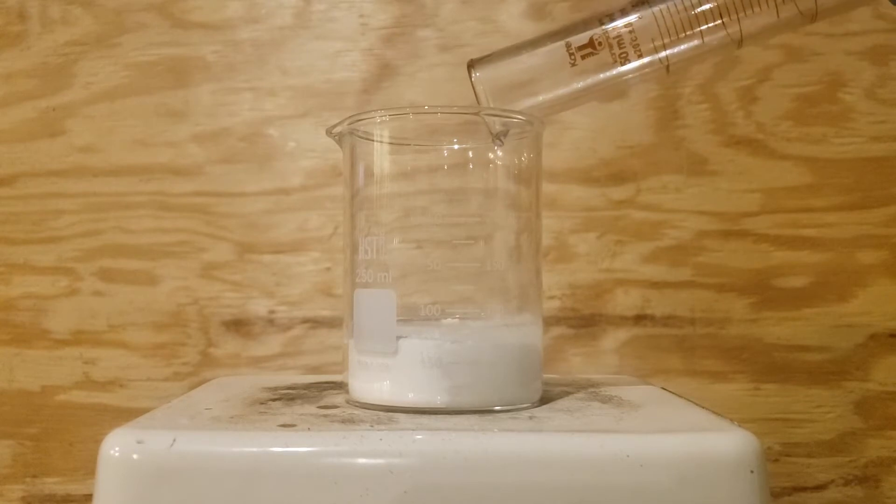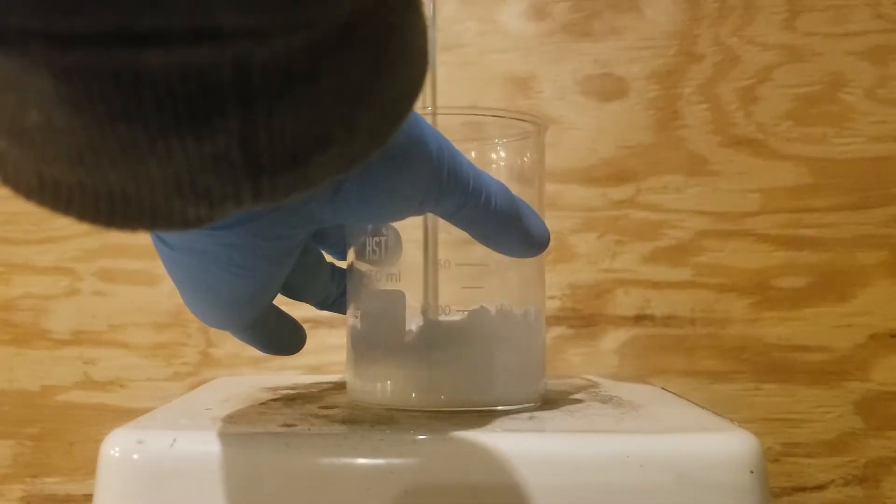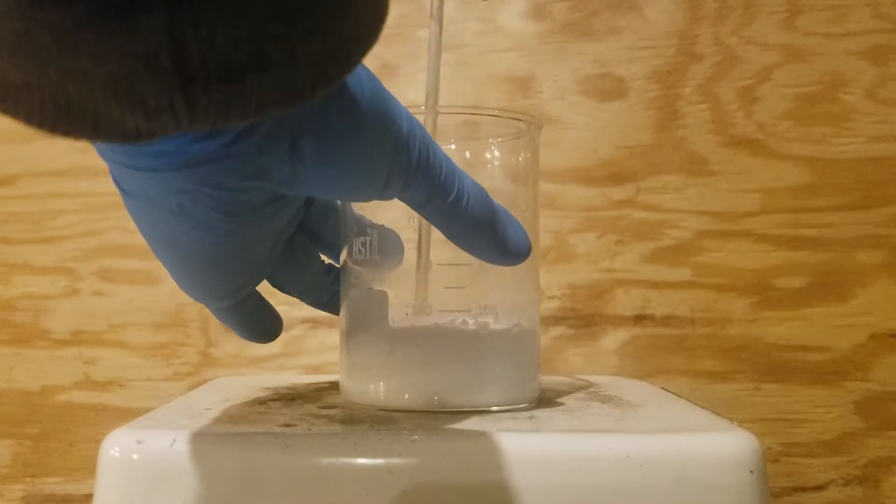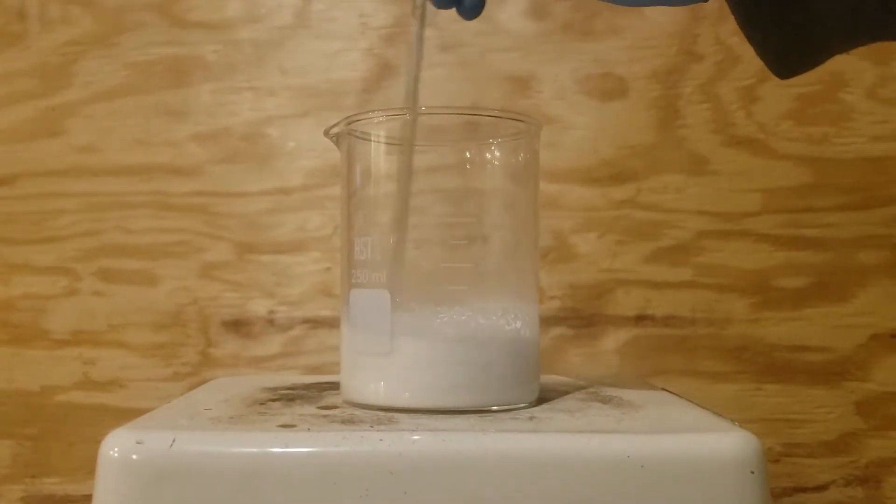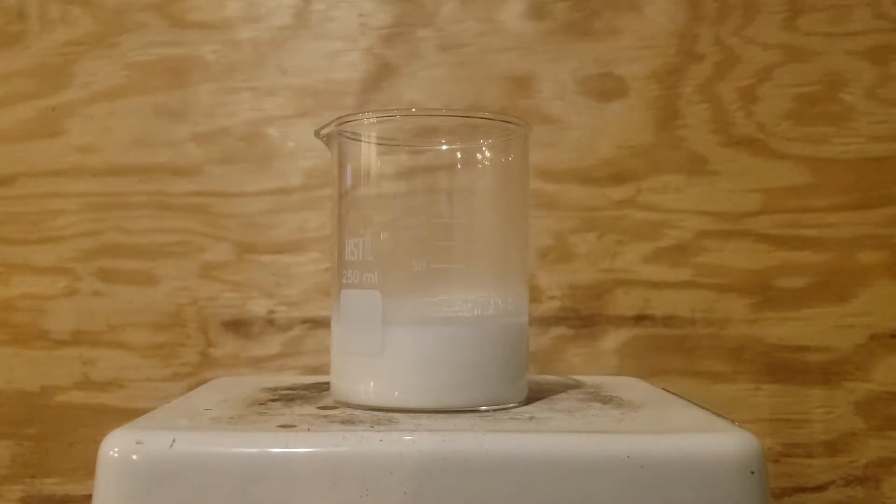I then broke up the solidified sodium tetraborate in the beaker and began stirring it around with a glass stir rod. Eventually, this freed up the mixture enough to where everything could start stirring automatically.